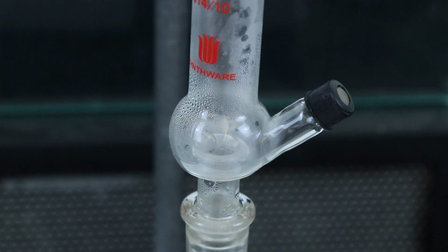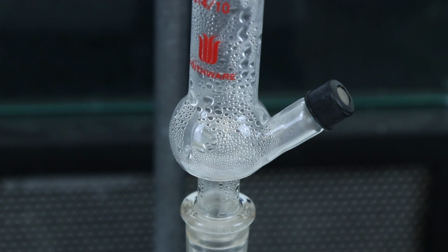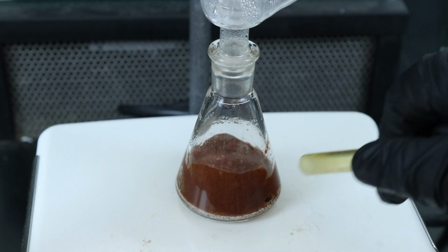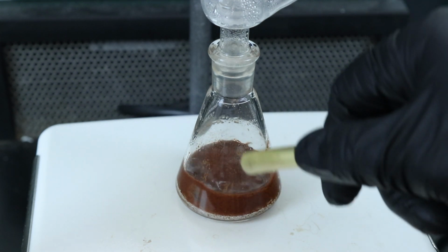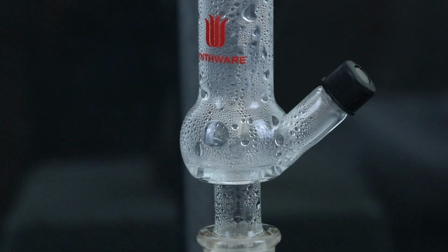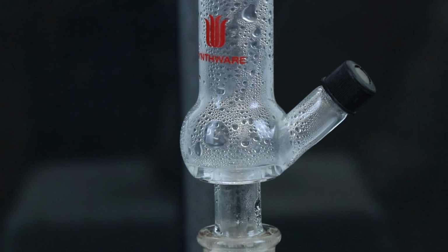Eventually, the distillate will start to condense in the Hickman still, and when the base fills up, we can begin gathering it using a Pasteur pipette. Be careful to monitor the cinnamon because we don't want it boiling up into the Hickman still. So if it starts getting close, lab air can be used to cool the flask down. Right now, it's actually not an issue, but I just wanted to show what to do if it did start boiling too violently.